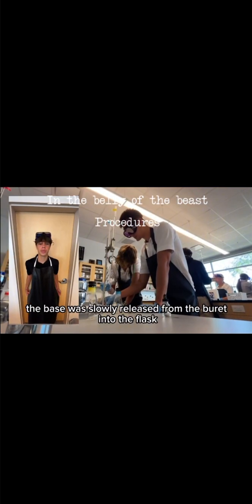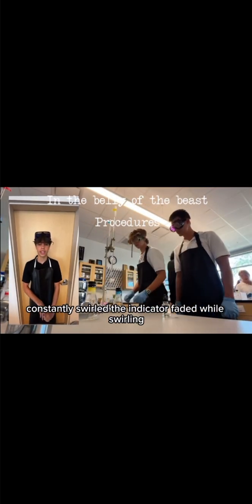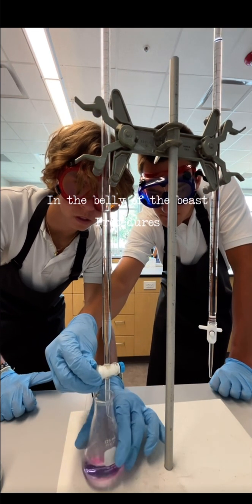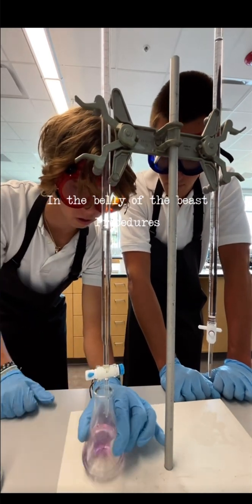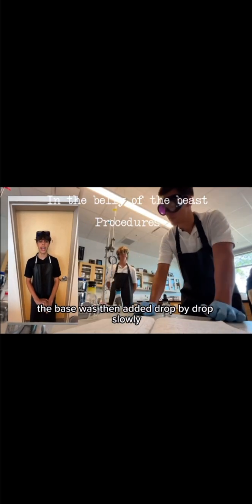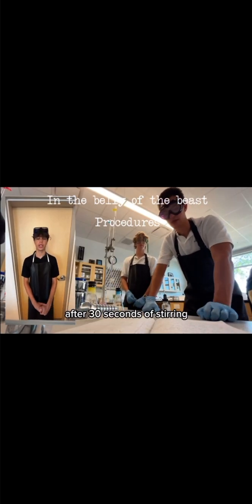The base was slowly released from the burette into the flask while it was constantly swirled. The indicator faded while swirled. When the color stayed for longer periods of time, the titration was nearing the endpoint. The base was then added drop by drop, slowly. The equivalence point was reached when a light color remained after 30 seconds of stirring.